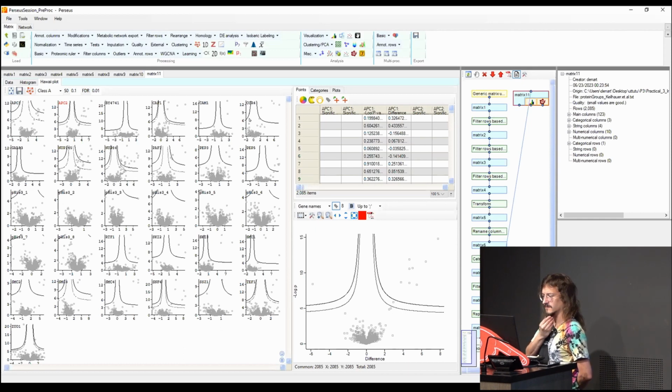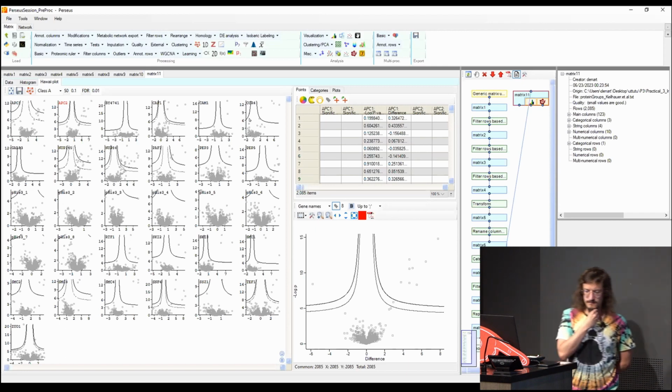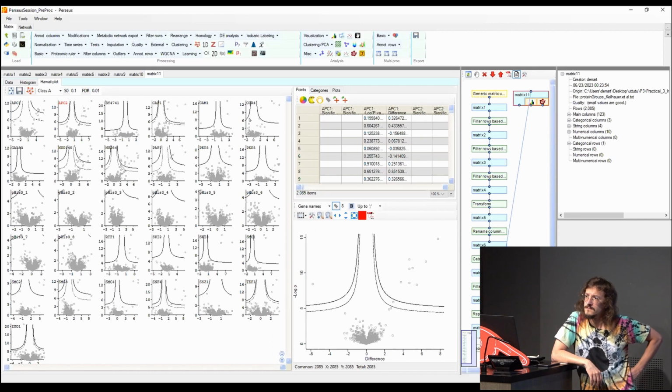And so the lines are created so that you get the FDR or q-value cutoff at 5% or 1%, indeed. But what is plotted is actually the p-value. I see. It was also a question that was asked yesterday: is it q-value or p-value? Here, the volcano plot is p-value, because otherwise, with a q-value, you would quench down all the dots, and you would not see them.